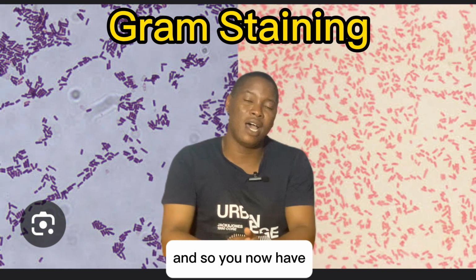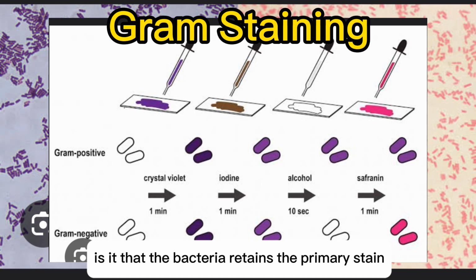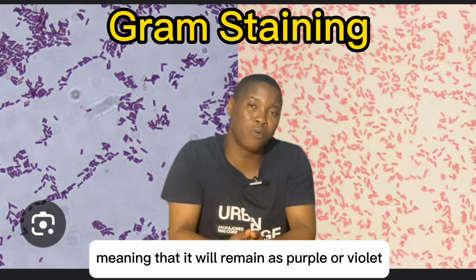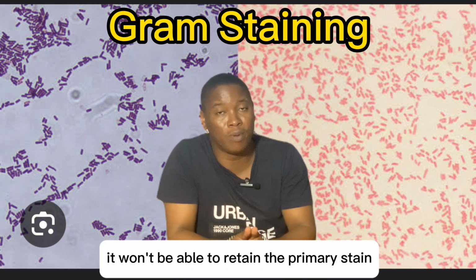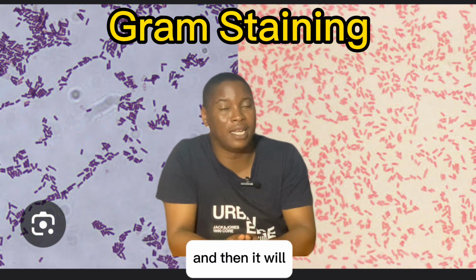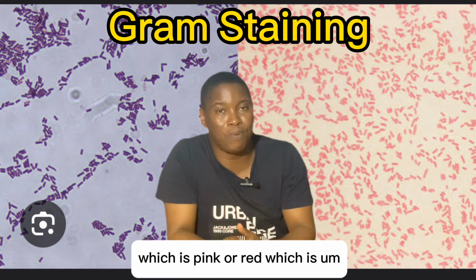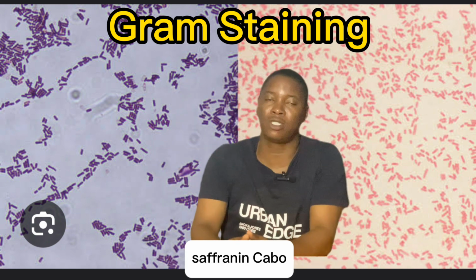So now one of two things happens. Either the bacteria retains the primary stain, meaning it will remain purple or violet, or it won't be able to retain the primary stain, and it will then hold on to the secondary stain, which is pink or red, safranin or carbofuchsin.